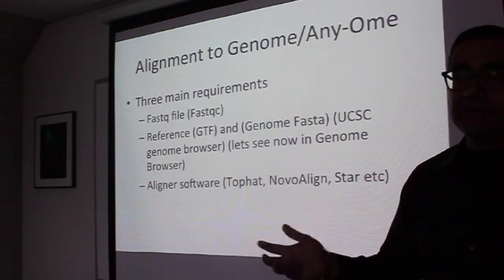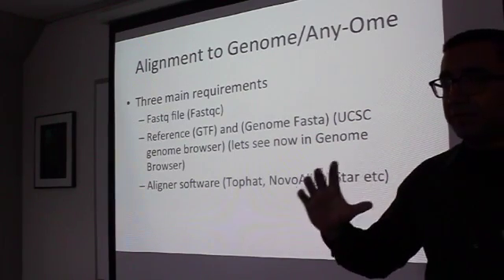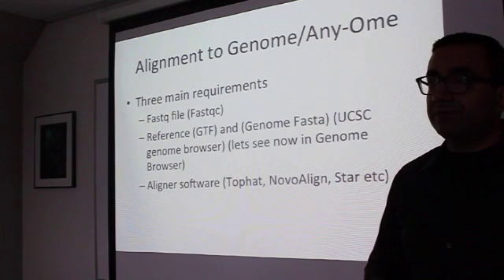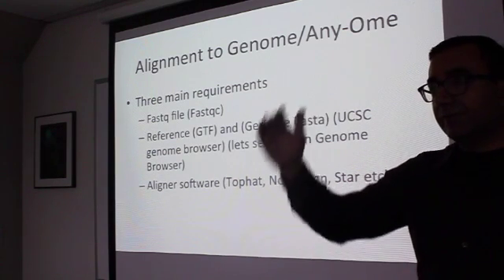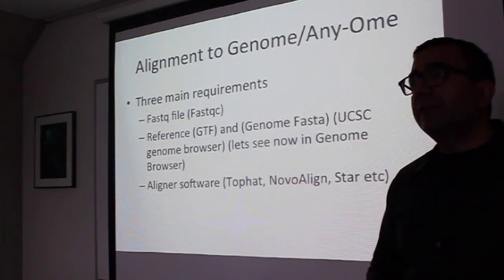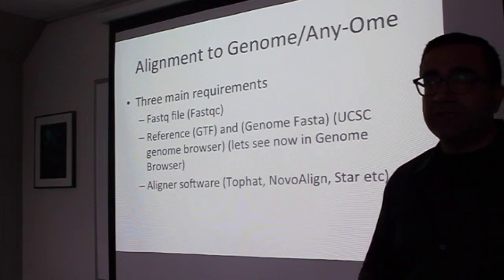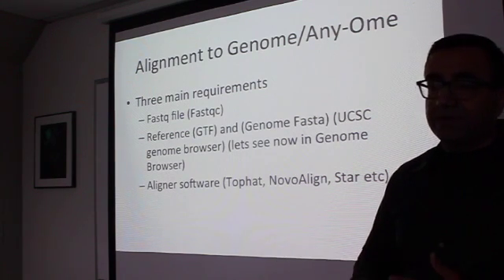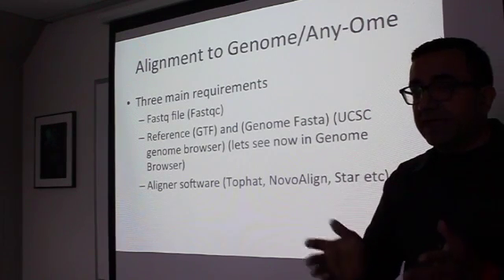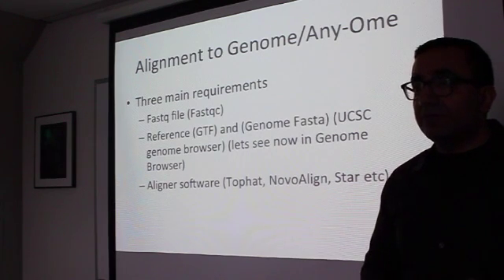They look almost alike because the samples are from the same run, and we only took 1,000 lines. So that's why the files are short, and why they look identical. If you were to take the entire file, it would probably have some differences. And some of you may have noticed the first few bases look like that. That's not important, but the fact that we can cut that off, that's the important observation to make.